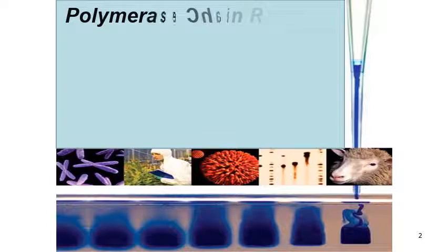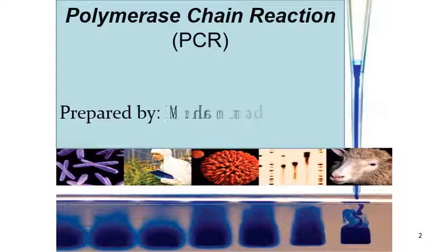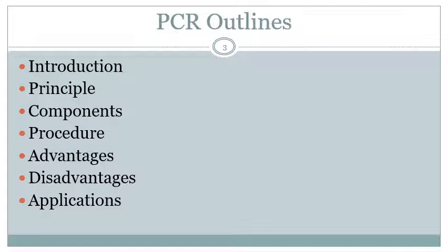Today, the topic of discussion is polymerase chain reaction, abbreviated PCR. PCR is a technology, prepared by Muhammad Ijaz, MPhil Zoology. In this lecture, the PCR outline is: first the introduction, then principle, components, procedure, advantages, disadvantages, and last the applications.